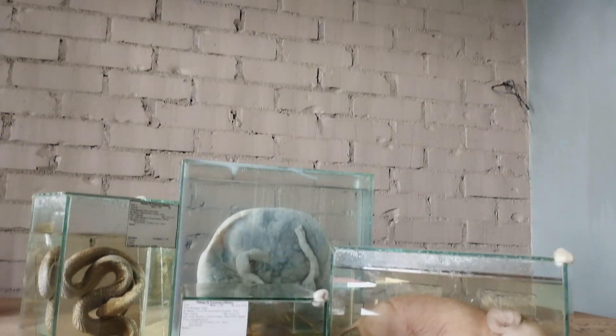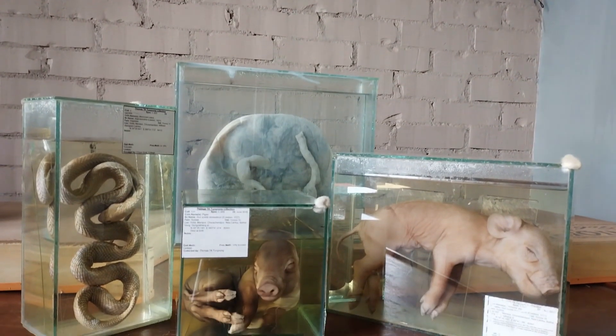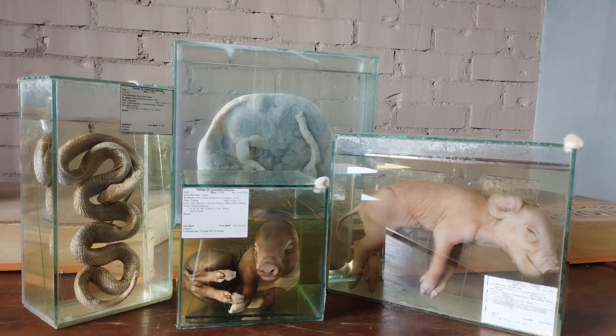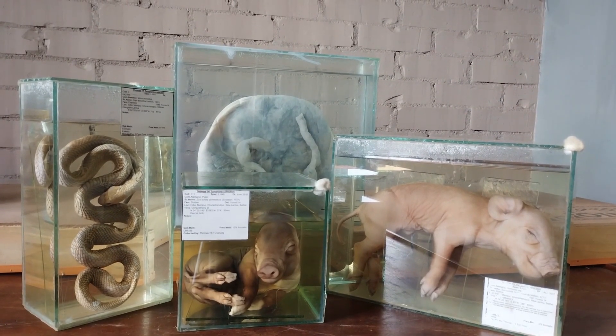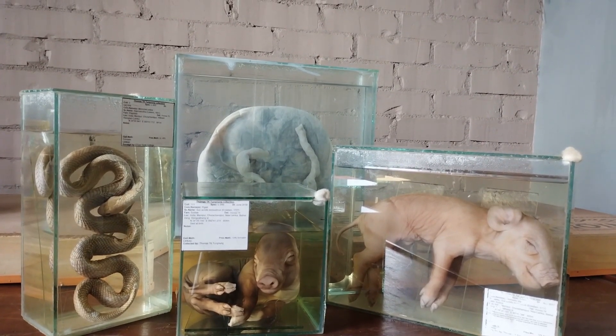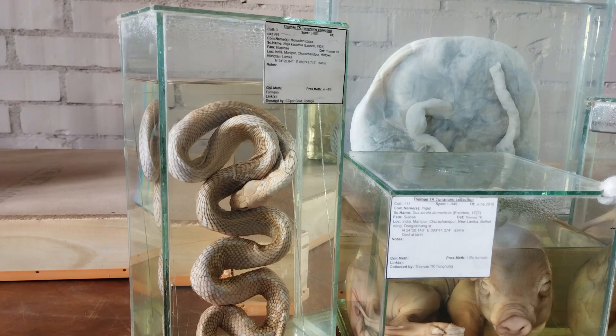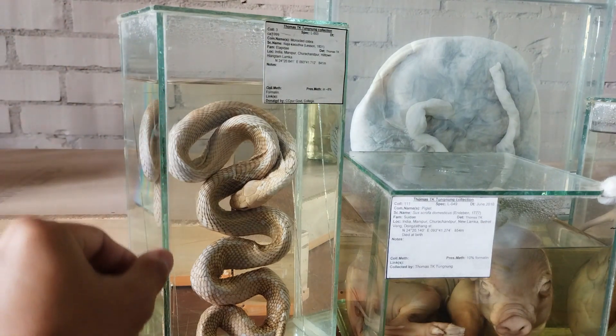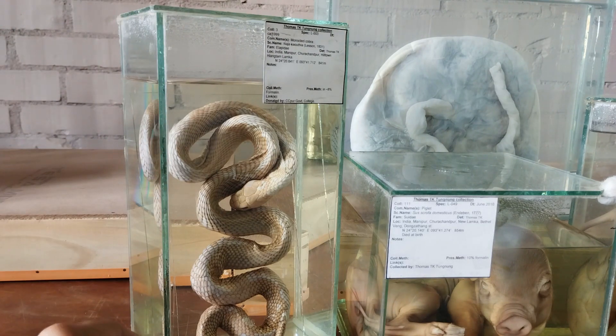My personal favorite when it comes to the container of choice for wet specimens is what is commonly known as the fish tank. Traditional aquarium tanks are usually made of ordinary windowpane glass sheets cut to the required size and then bonded together with a special type of adhesive called silicone sealant. Silicone is a fairly chemical resistant material and if applied properly along the edges of the glass sheets results in a fairly durable watertight receptacle for storing specimens.